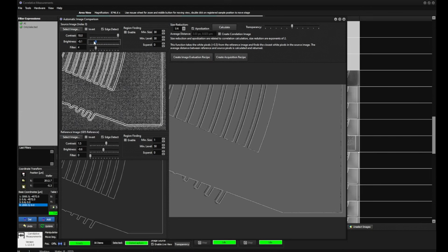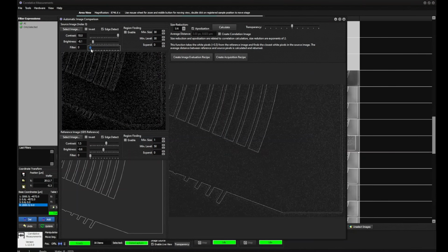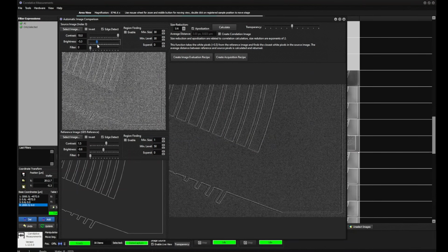If we want to make an edge detection, this normally needs to be normalized, then filtered, first the edge filter and then also a lateral pixel filter, and this we can adjust with the sliders here. You see the normal image is somehow noisy.